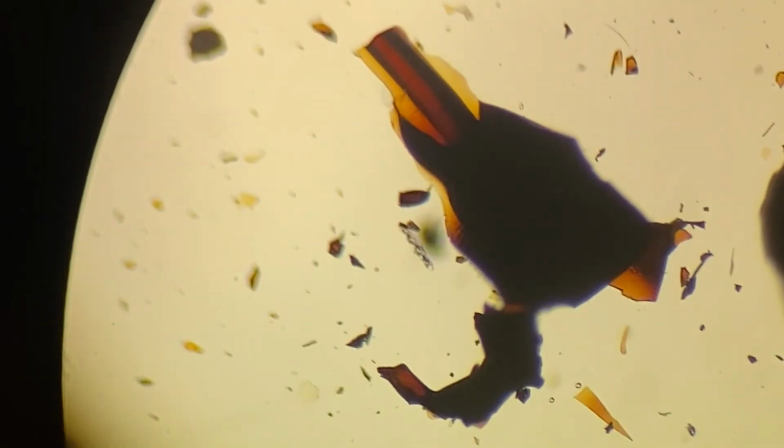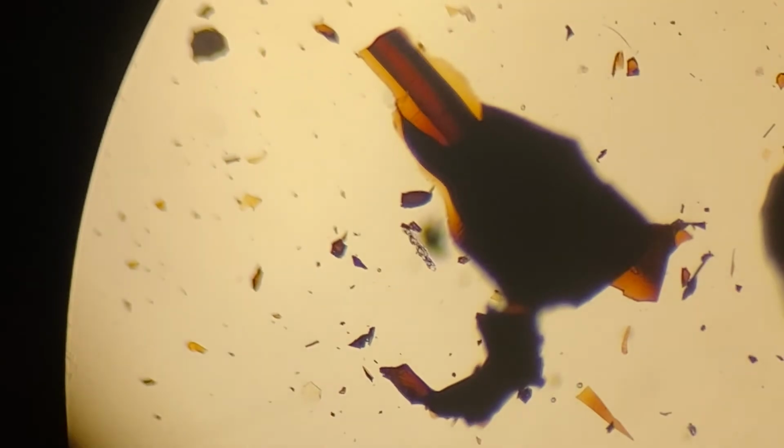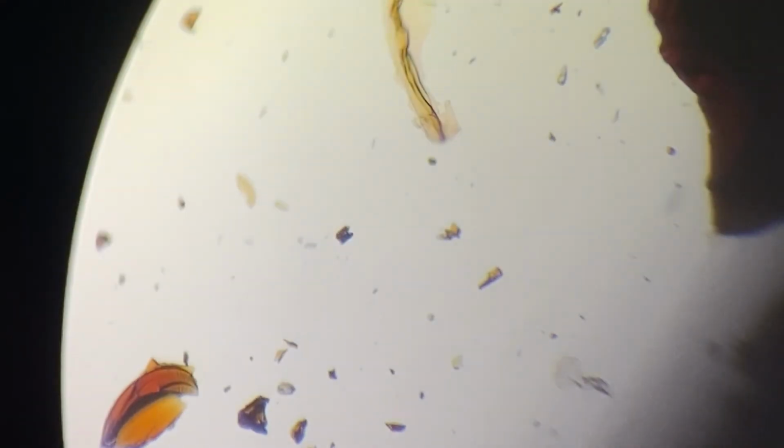Let's see if I can... Well, first let's see what it looks like when I turn the light off. Okay, yeah, it looks like obsidian glass or something like that. Obsidian is kind of the smooth lava rock. You know what I'm talking about? Let's see what it looks like on medium power. Gives you a little better perspective for your observations.